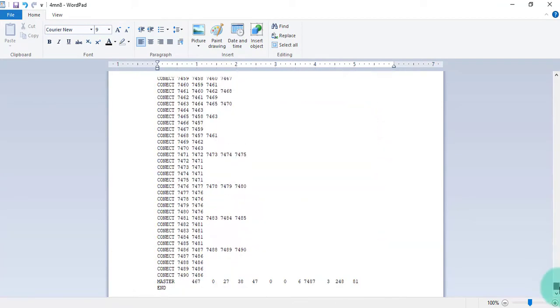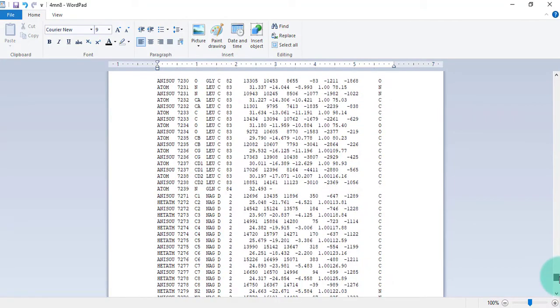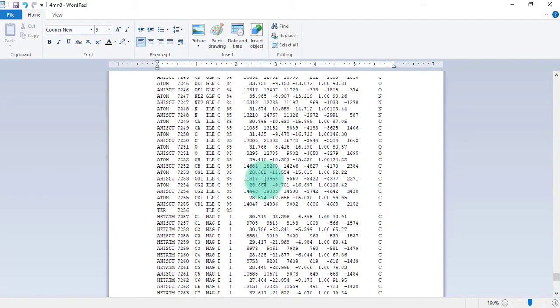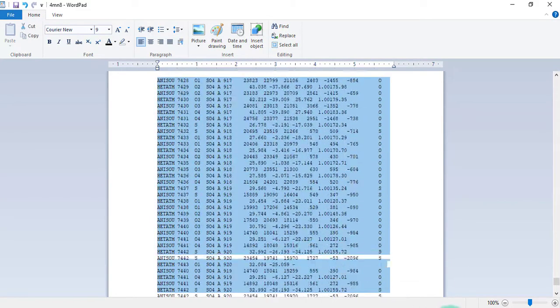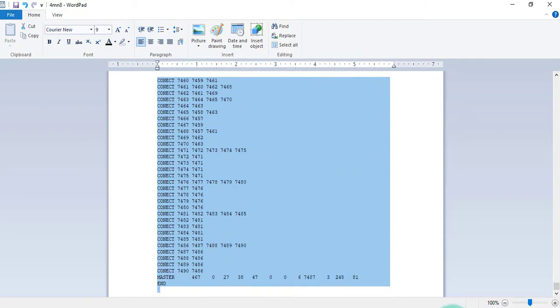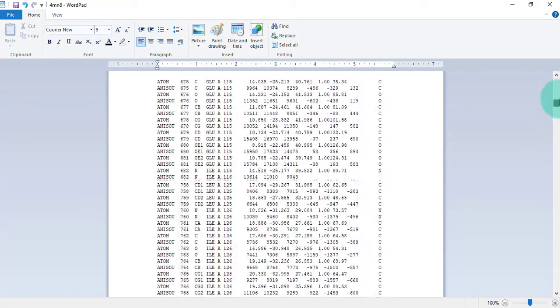It started from 68 and then it ended at 85. Okay, and here we can delete all these because these are the ligand files and other ions that we have just seen in the PyMol. So I'm deleting all other things. Now we have only 3 protein structures here.